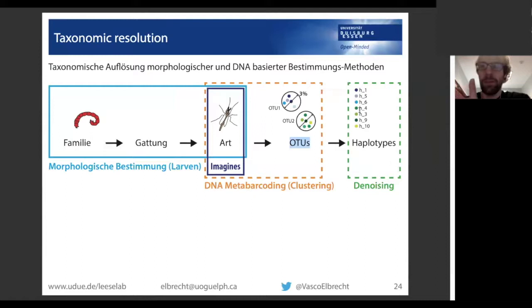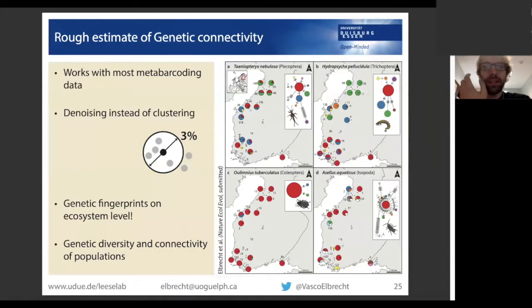And this means that we can actually do something really cool, and this is doing population genetics with DNA metabarcoding. So it's not really population genetics, because it's very crude data, and we have to apply a lot of filtering. But what you can do is you can get your sample, you grind it up, you do your metabarcoding, and then with your metabarcoding data set, you can basically take a look at genetic diversity of everything you have in your metabarcoding data set.